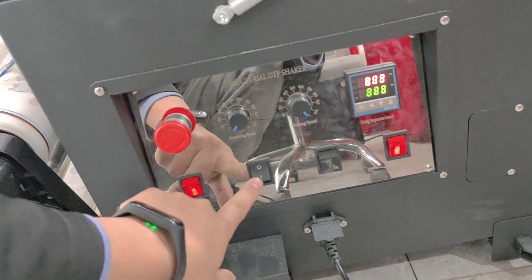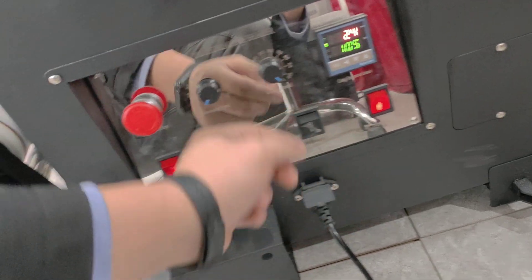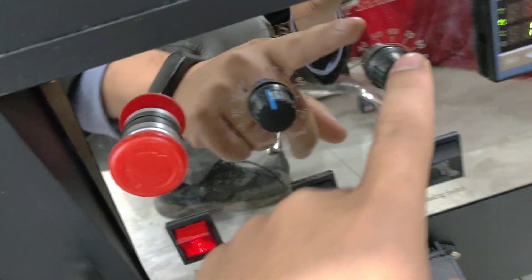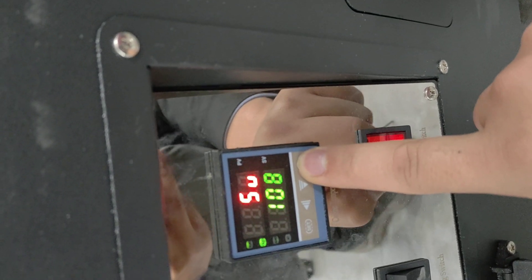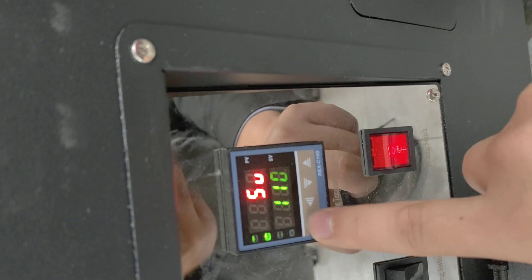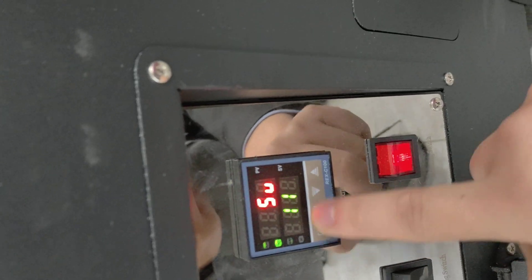First, open this, open this, open this, and open this. Adjust this to 15 and this to 16. Now you can connect this one to adjust the temperature to about like this. Enter — it's finished, you can check.